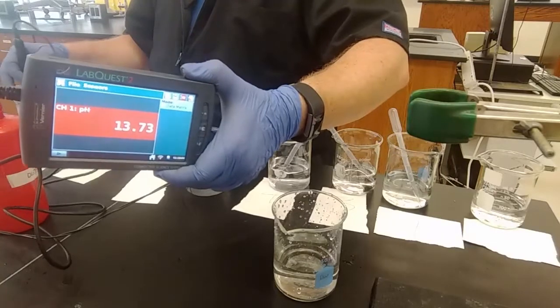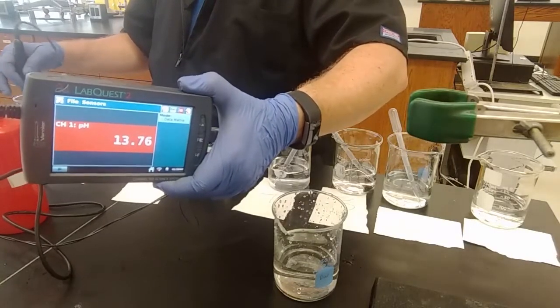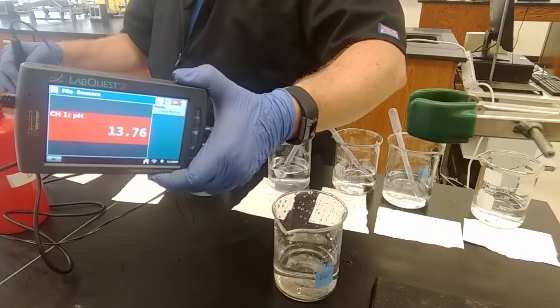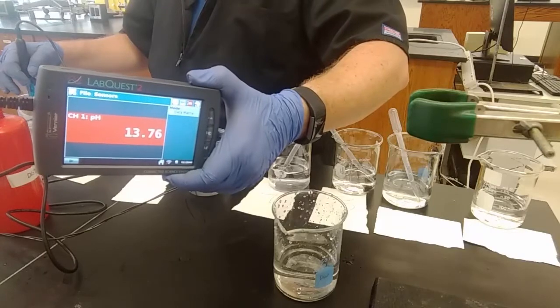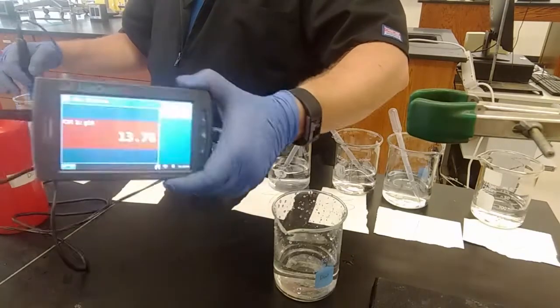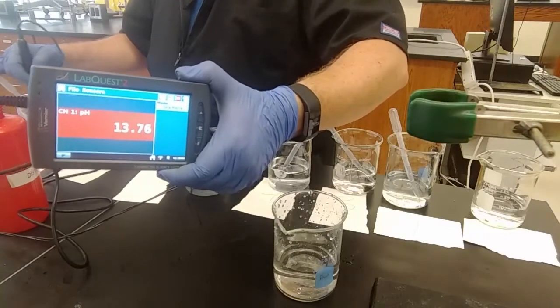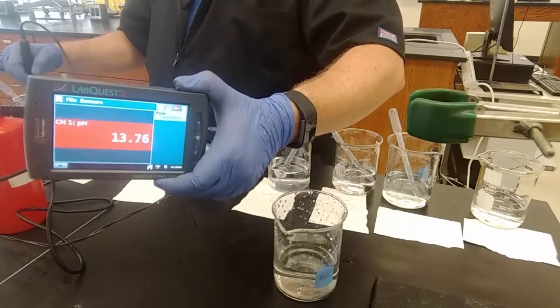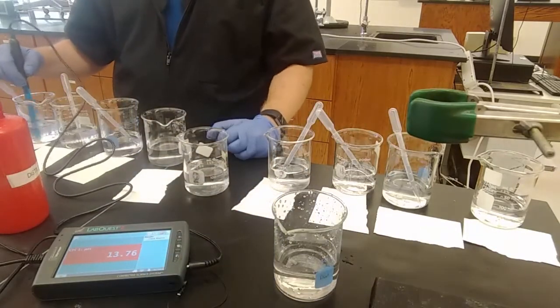We're at the edges. Maybe not. 13.76. A fine vintage. 13.76 seems to be all we're going to get out of this expected pH 14.